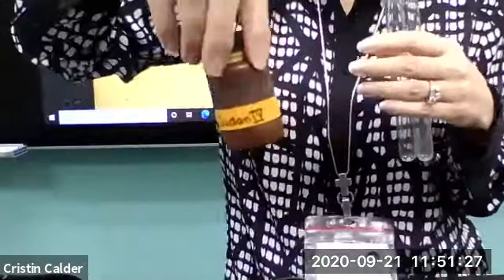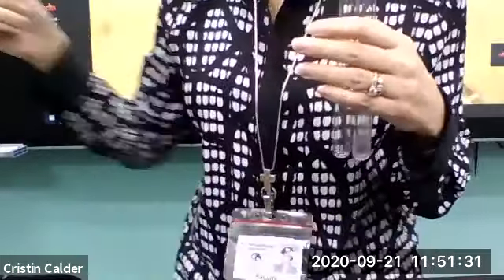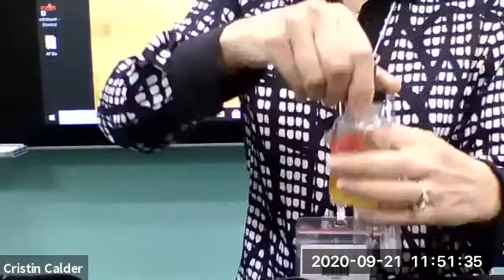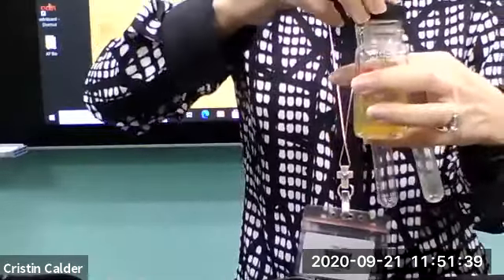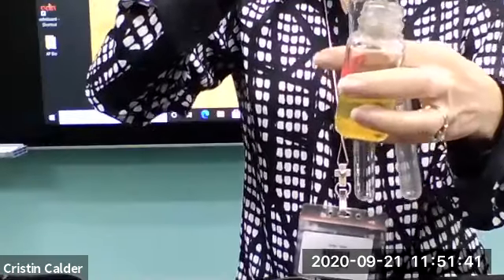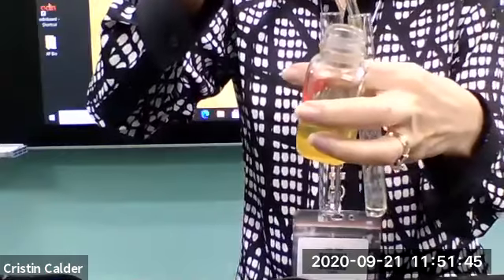All right, and last but not least, I'm going to do the Sudan IV test. So this is Sudan IV, it's a powder. This is going to test for fat. So we're going to actually use some oil. I happen to have some mineral oil here. So we're going to put some oil in one of these test tubes. I'm not going to put a lot, actually. Oil makes a big mess.